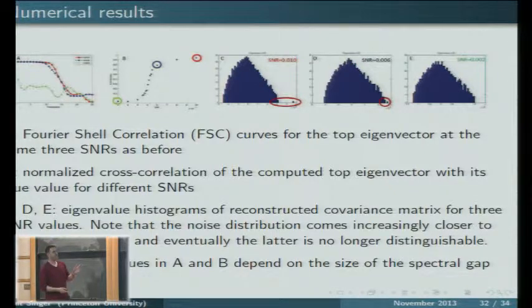So from this spectrum of the eigenvalues of the asymmetric covariance matrix, we can tell the biologists reliably how many groups we can actually detect, just the number of eigenvalues that pop outside this distribution, provided that we can actually characterize this distribution. We know how to characterize Sn, but now we also have this inversion by L. That's why it's important to understand this spectrum.